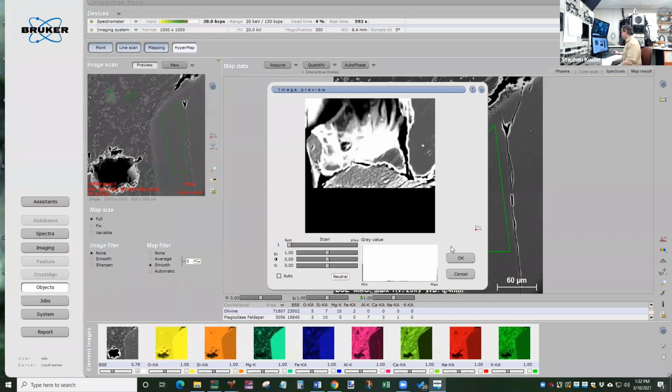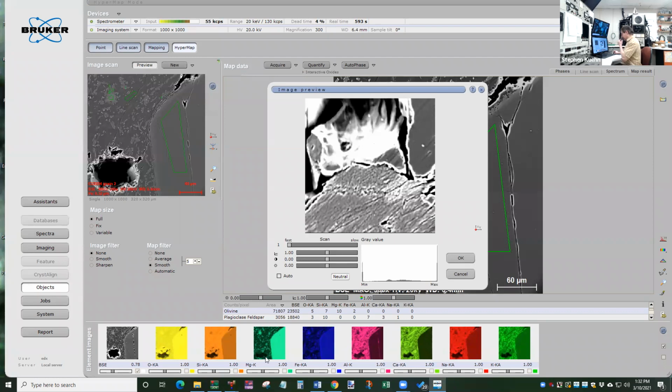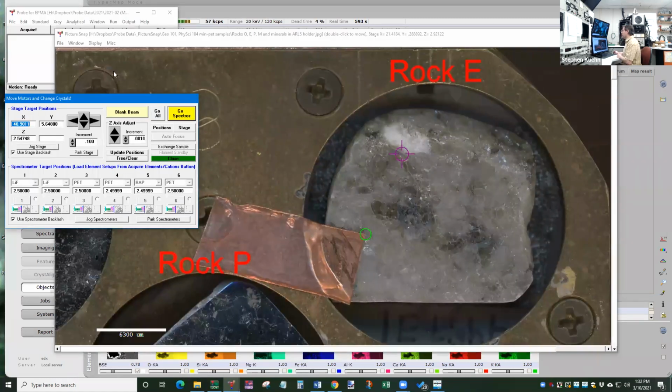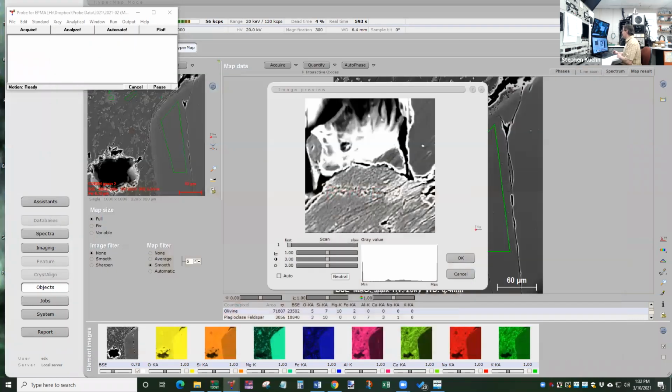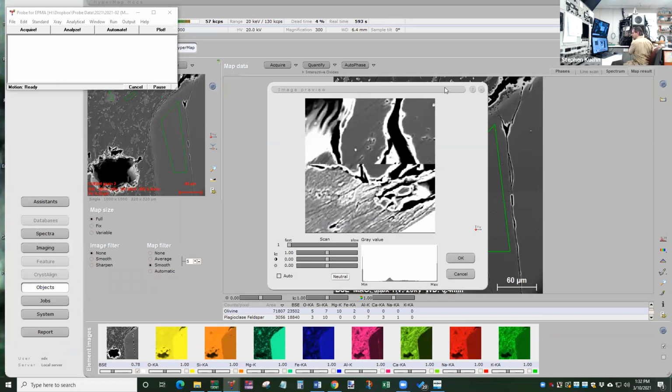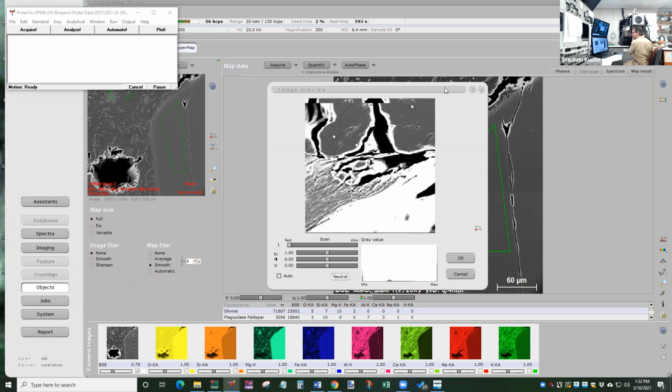Go preview. Maybe I'll put that on the other monitor so I can get to it easier. Right. I need to tell the computer to give me control so I can move it around myself by hand. All right, so actually this looks like a pretty good spot.